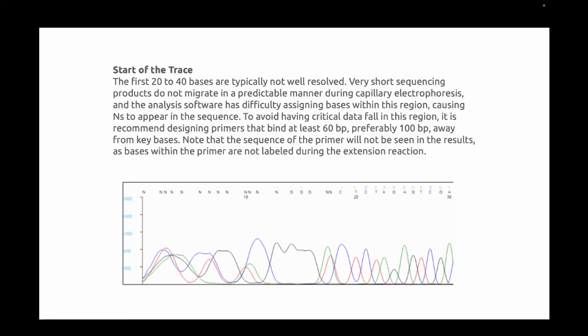Each curve is a different color, showing you different bases or nucleotides. If your peaks are all together at once, say for example this one at this position, what will the base caller say? Is it A, T, G or C? It can be anything according to the peaks.